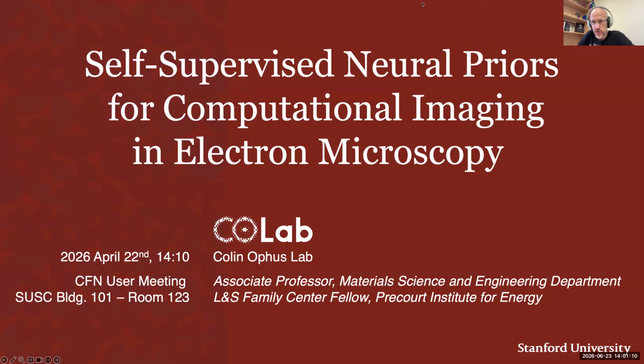All right, well, thank you guys so much for inviting me to give this talk. So I saw that Gerd and others were covering a lot of nanobeam diffraction, and so I've slightly changed my topic today. In the original abstract, it was listed as 4D STEM, and so I'm going to give a fair bit of information about 4D STEM, especially ptychographic imaging and other similar phase contrast imaging methods, but I'm also going to cover tomography as well, because we have a large machine learning effort in that direction too.